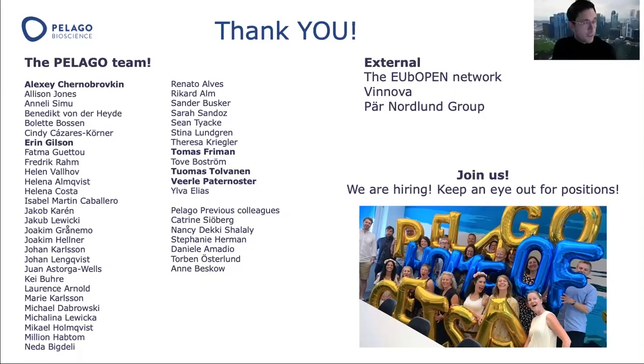Yeah, and I think what we do in the Prebiom project that I just flashed is that we look at different donors. We could probably see them as different cell lines if we want, but I wouldn't. Obviously, if you're not adding something, you can't dose it. So you would have to run melt curves. If you run melt curves of different cell lines, you're probably going to end up with a number of proteins that differ in melting temperature. It's not going to be all proteins, but maybe 10% of the proteome that shifts depending on the cell line. That's what I would think.